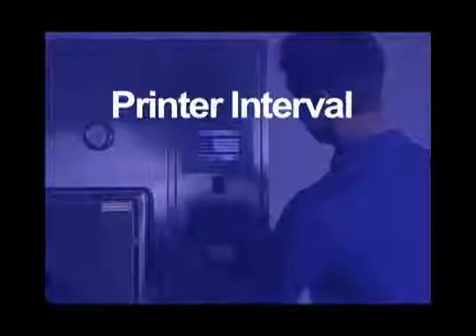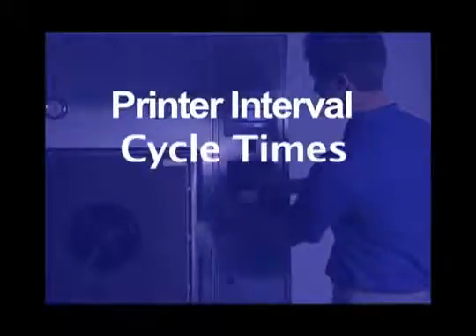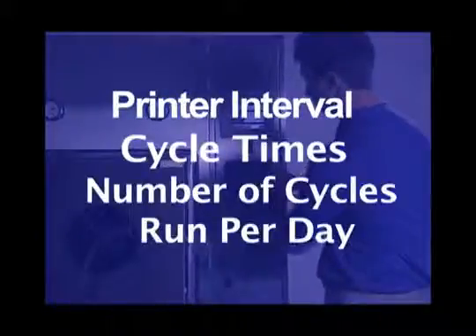Remember, how often you have to change the printer paper is dependent on settings that you define, including printer interval, cycle times, and number of cycles run per day. We recommend having between five and ten extra paper rolls on hand at all times. To order new paper rolls, please contact your local CSS authorized parts distributor.